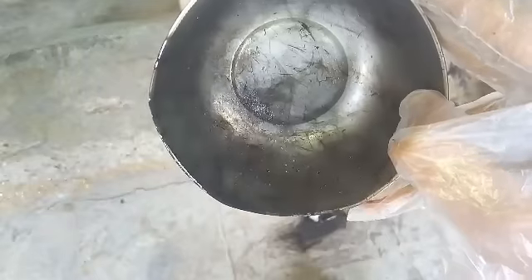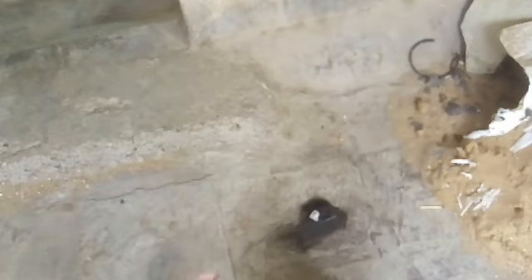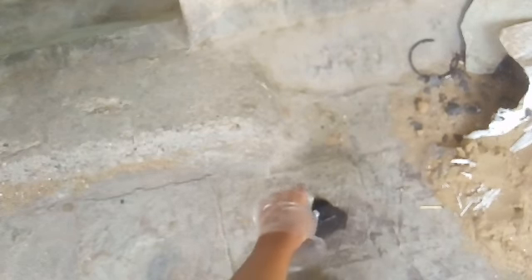I'm gonna see what's inside of it now. You can see some carbon formed on this. You can see some crystalline. You can see there's some sparkling, and that's because of some crystalline naphthalene also went on it, right? So I'm gonna do this again like that, and let me collect all the carbon from it as much as I can, and then I'll be back.